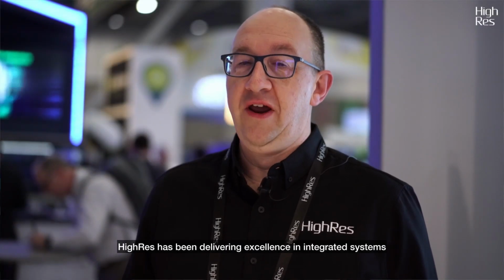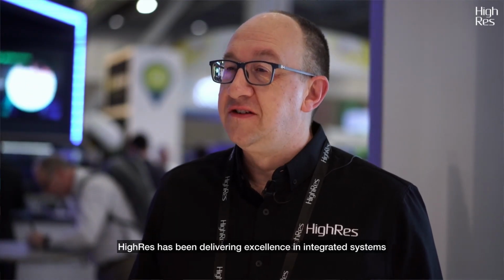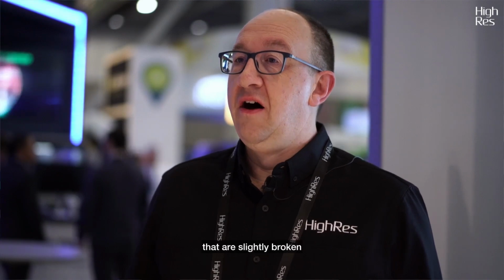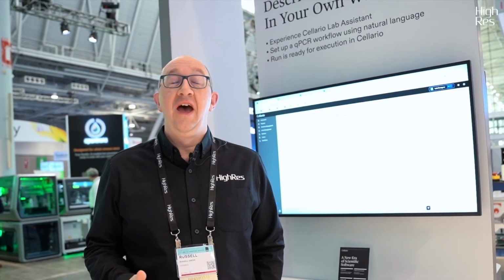For the past 20 years, HighRes has been delivering excellence in integrated systems. We are known to be the market leader in automated workflows in the life sciences space. However, through that time, we've seen countless labs that are slightly broken. They have fragmented workflows, siloed operations, and really messy data flows.